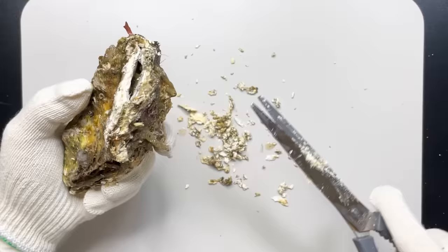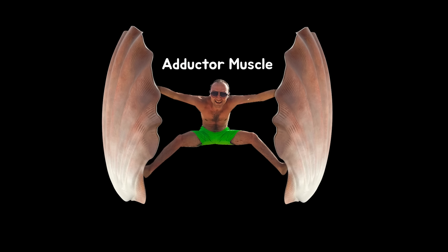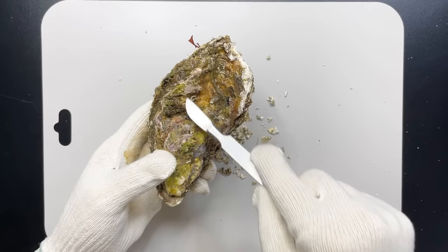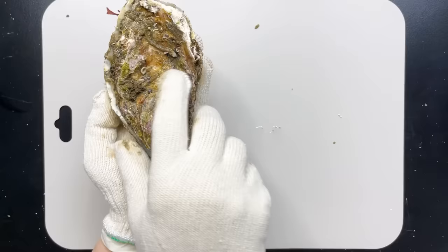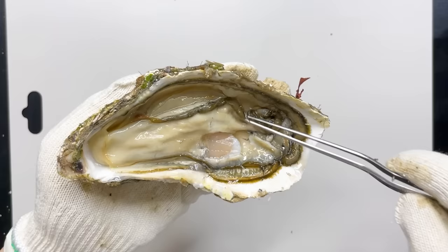Then you will find a gap between the shell. Bivalvia, which has two shells, has a muscle called adductor muscle that holds the two shells firmly. So, you can easily separate the shell by cutting the adductor muscle. Oysters have an adductor muscle in the middle of the body, so if you put a scalpel in and cut it, it can be easily separated like this. On the inside of the shell, you can see the traces of the adductor muscle attached. And this is the inside of the oyster.